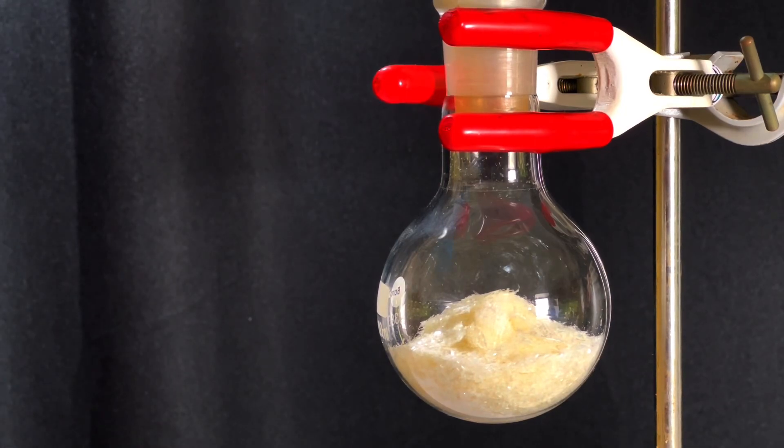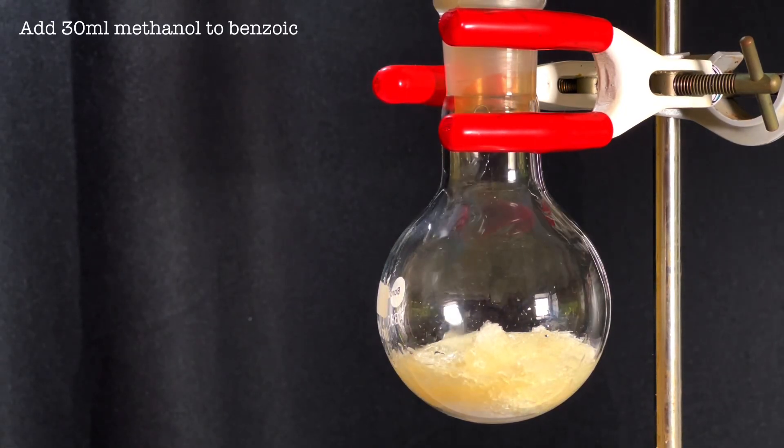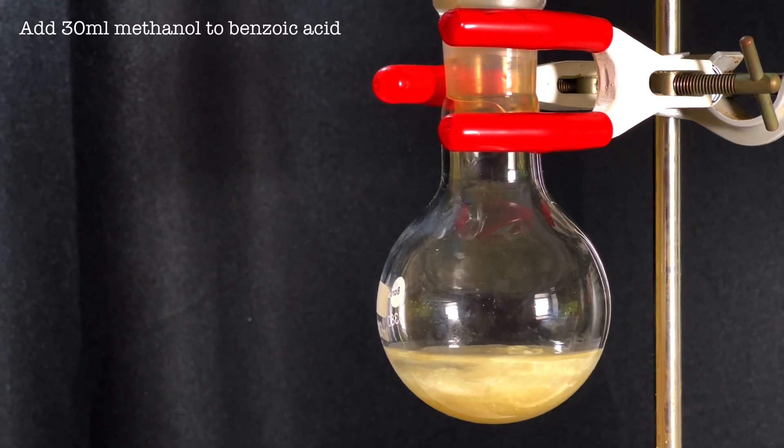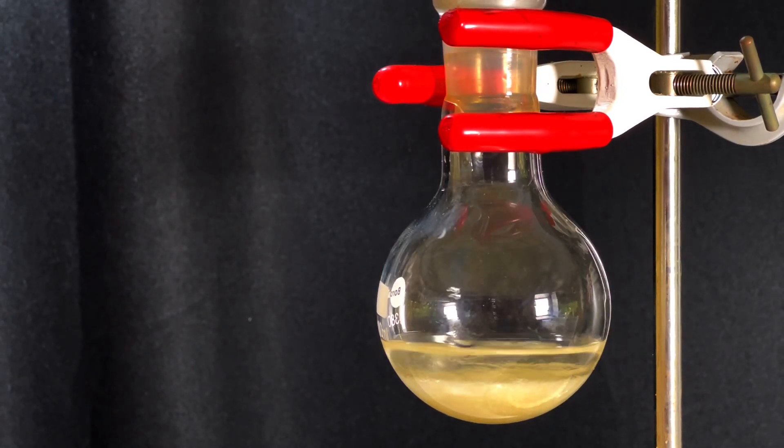Next add 30 milliliters of 99% methanol. Benzoic acid is extremely soluble in methanol and here you see most of it has dissolved.